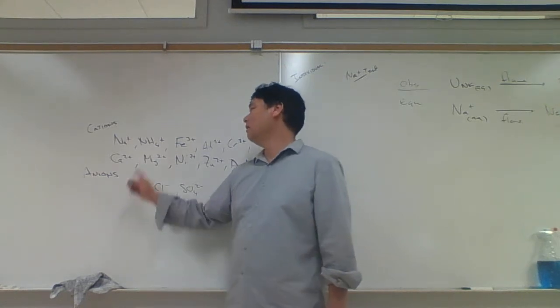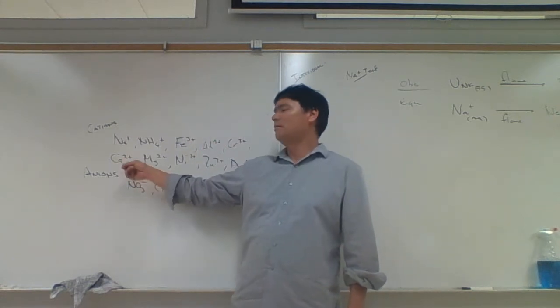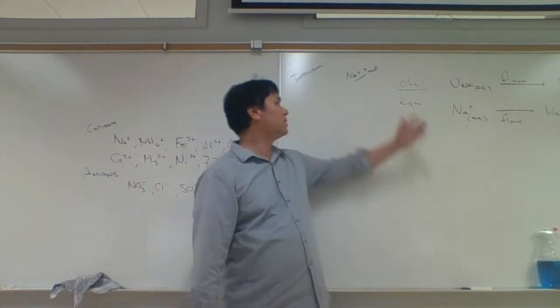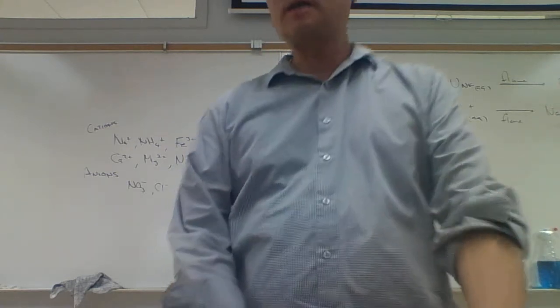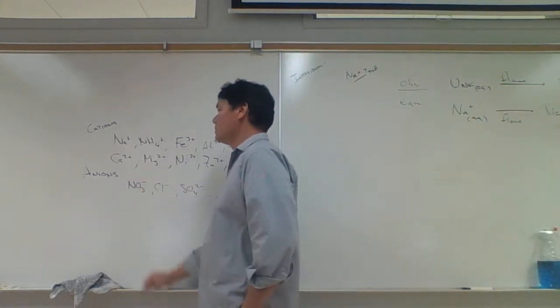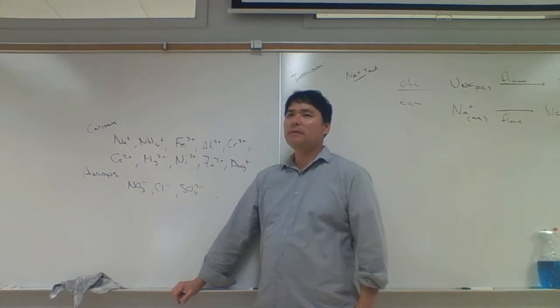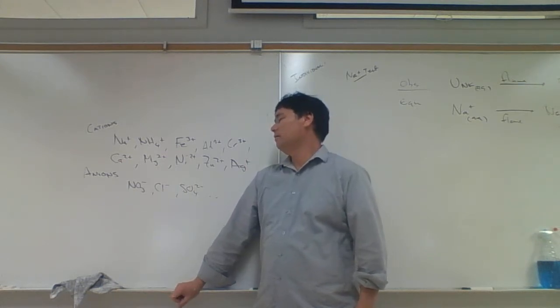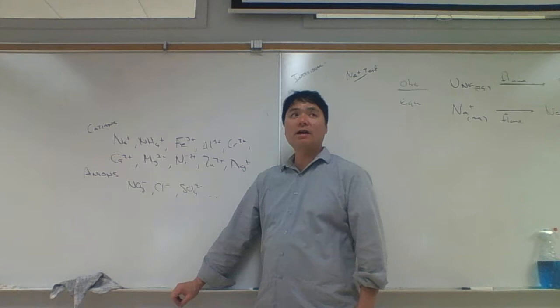And so we're going to just clean the wire once, test it for calcium, and then in a separate sample, we'll test it for sodium. Not in the same sample, because we can't test for calcium when there's sodium present, because the sodium interferes with the calcium test. Interferences, that's a big problem in qualitative analysis. We've got to make sure that other species aren't interfering in our analysis for a specific analyte.